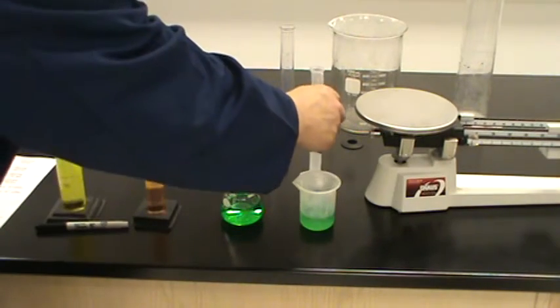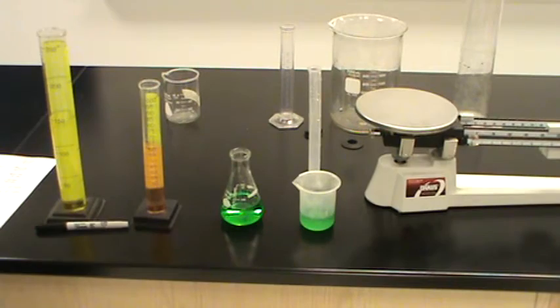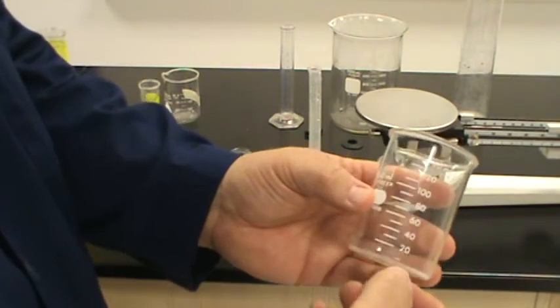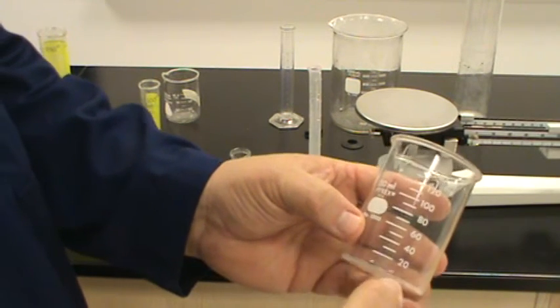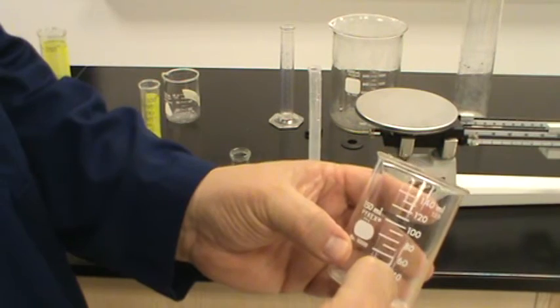Okay, then the next thing I asked you to do was to put 50 milliliters into the beaker. Now, some of our beakers don't have a 50 on them. They're done in 20s: 20, 40, 60, 80, 100. Well, in this particular one, the middle mark would be the 10, so it'd be 20, 30, 40, 50.